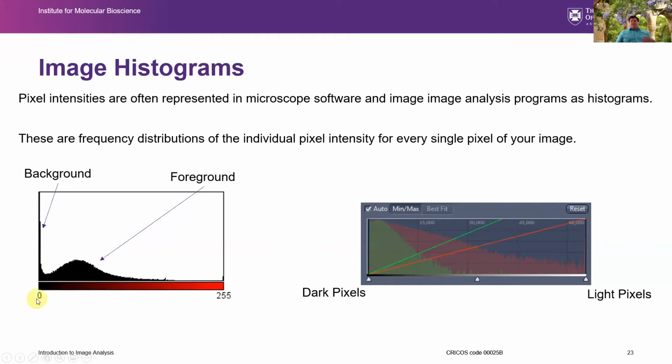So black pixels, or really dark with a low value, are going to be all stacked up here on the left side, while the bulk of the data for the objects is skewed across this range from about maybe 25 to 150. I can also see from this histogram, there's a little bit of a spike at the end here, which would suggest that some pixels have been saturated.